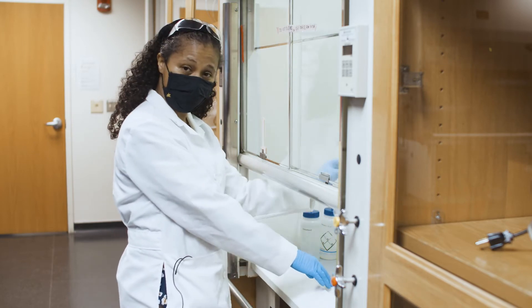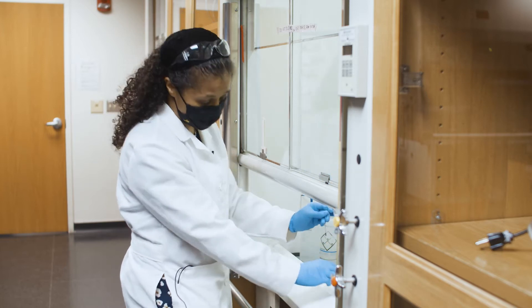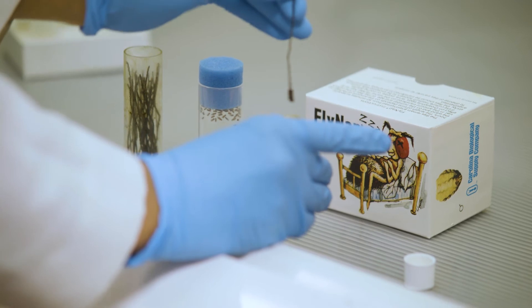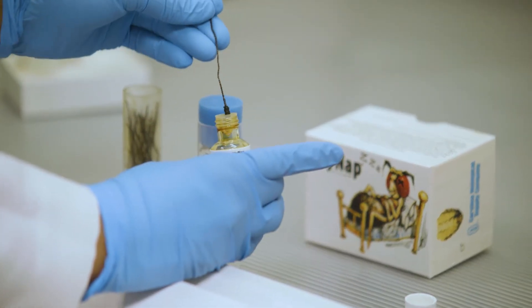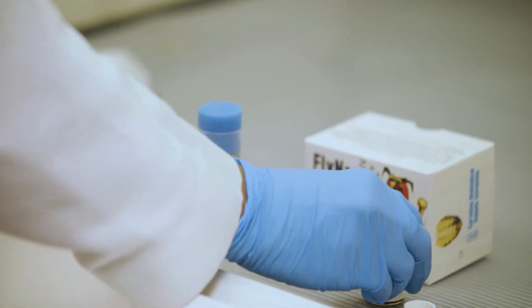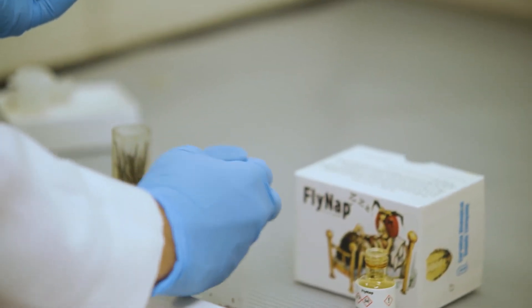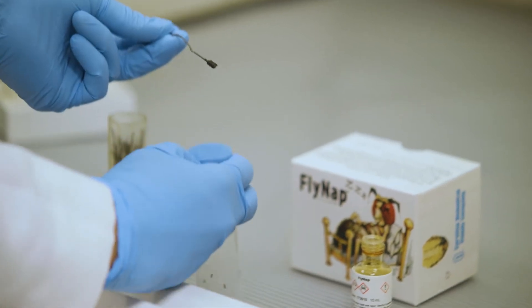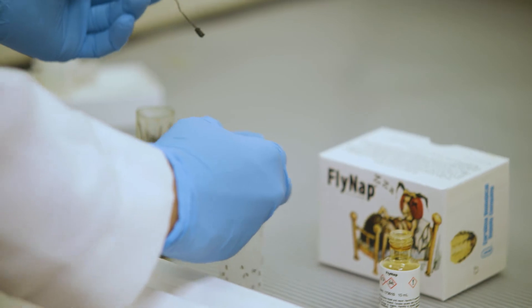I'm using this in the hood because this is a nasty chemical to inhale. You will get a headache if you start smelling this stuff, so whenever you use it it's best to use it in the hood. All I'm going to do is dip my little black wand into the FlyNap, tap my flies down so they don't escape, and then insert this wand in between the plug of the vial and the wall of the vial.